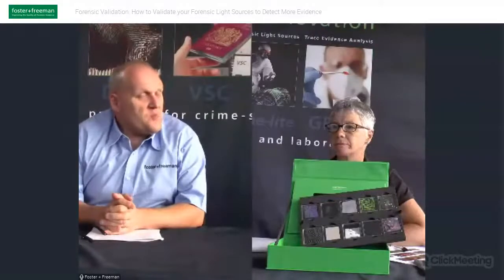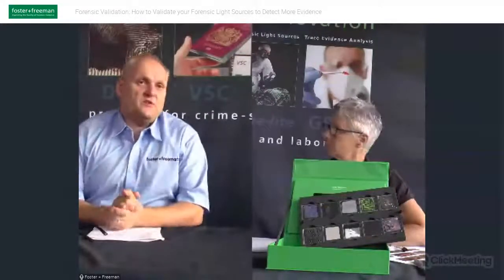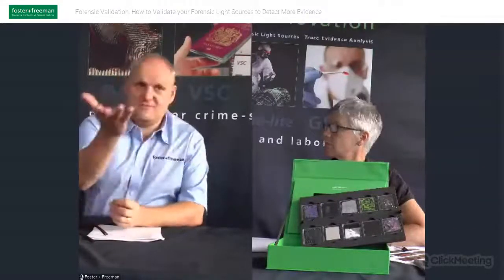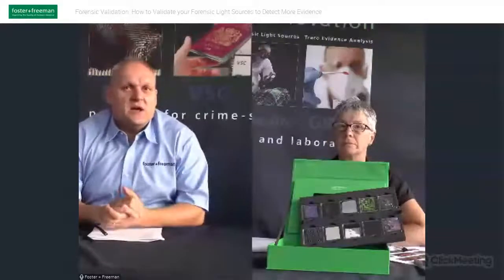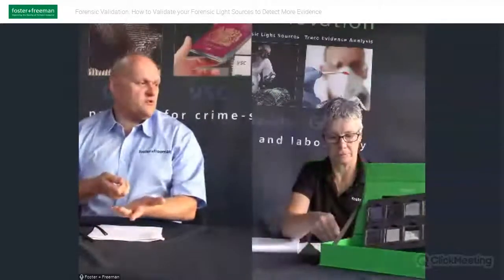And I think when we do training here, and especially at the moment due to COVID, we're having to do training using videos exactly as we're doing here. One of the biggest problems when you're trying to explain how to use the light source is having the same sample both at the customer's side and our side. And the way these kits are designed, they will always give the same sort of results.